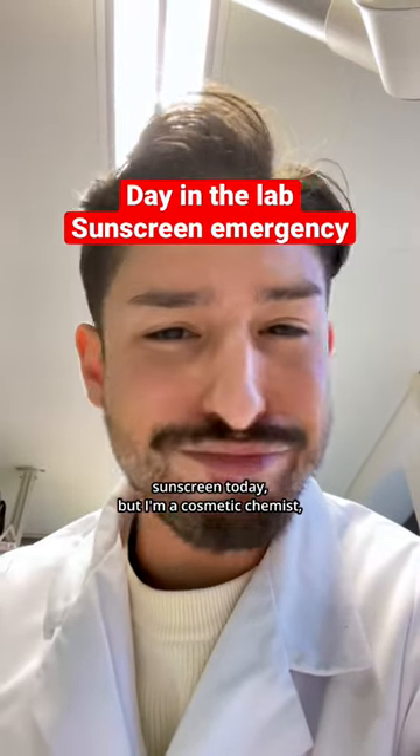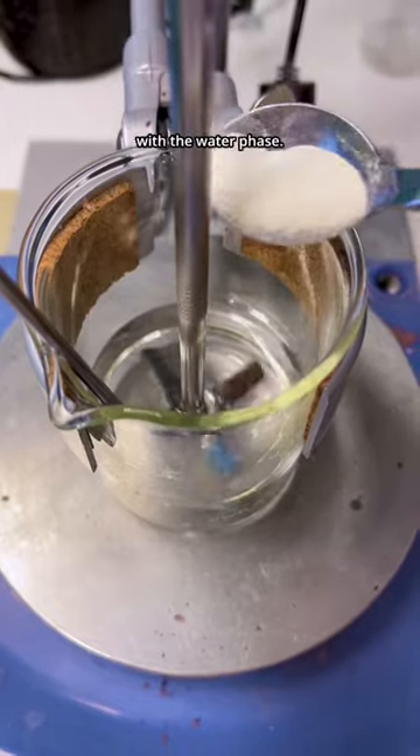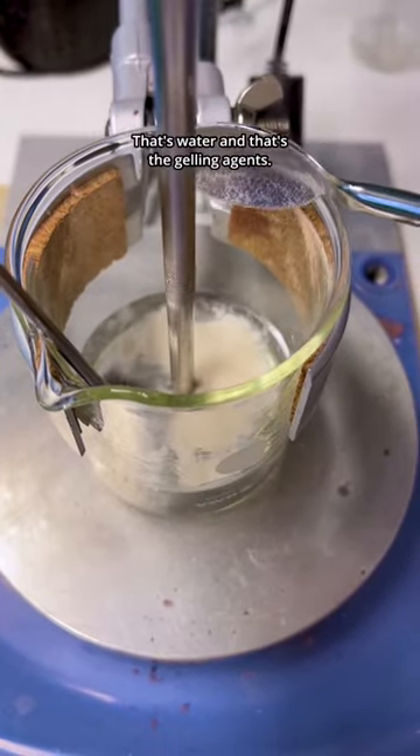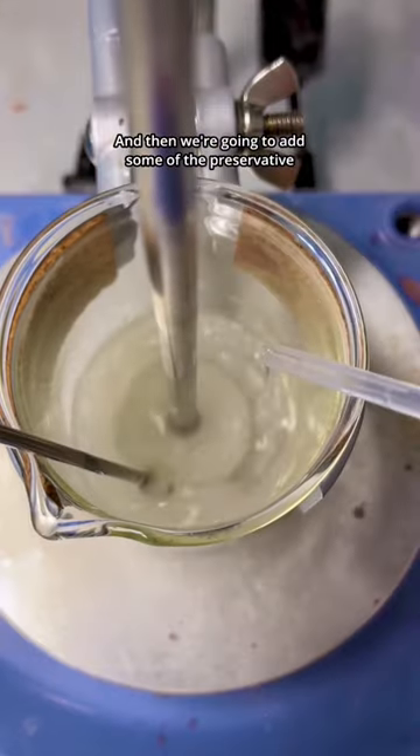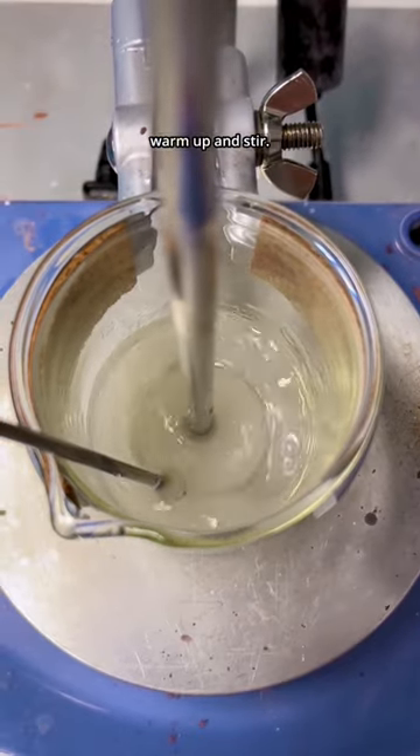I forgot to wear sunscreen today, but I'm a cosmetic chemist so let's just make some real quick. First we're going to start off with the water phase — that's water and that's the gelling agent. We're going to add that and let it gellify, then add some of the preservative boosters and humectant, and let that warm up and stir.